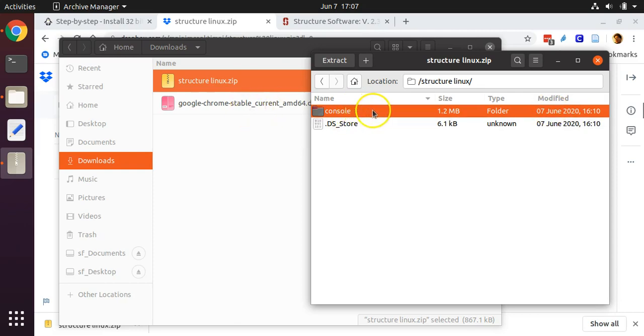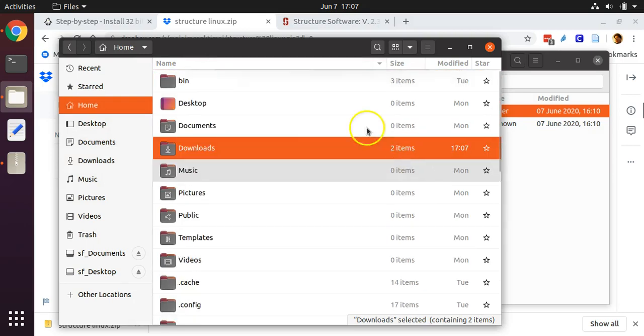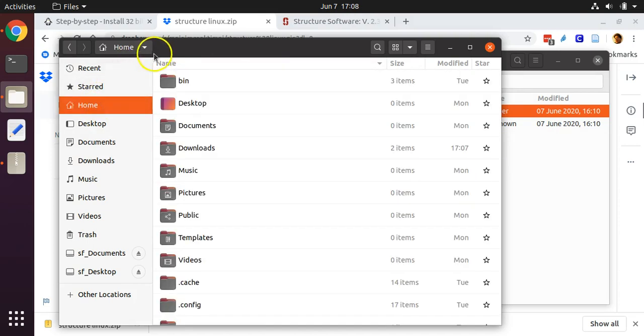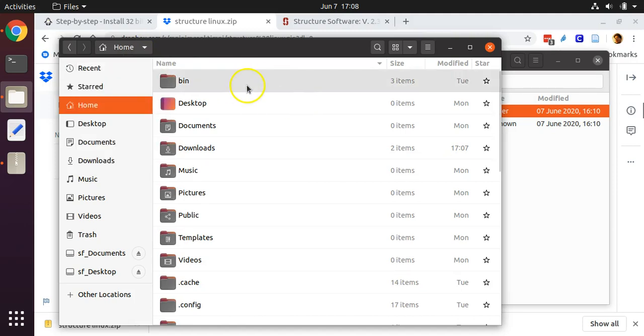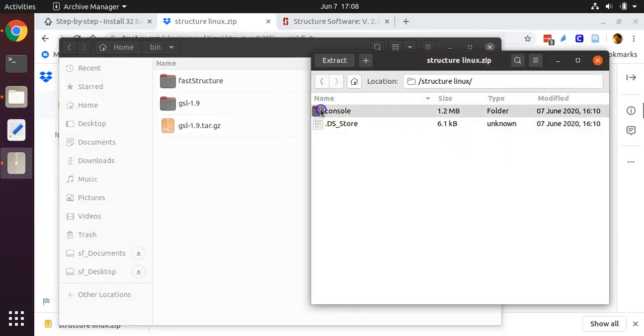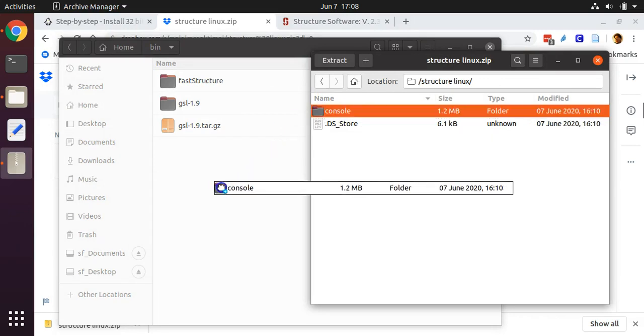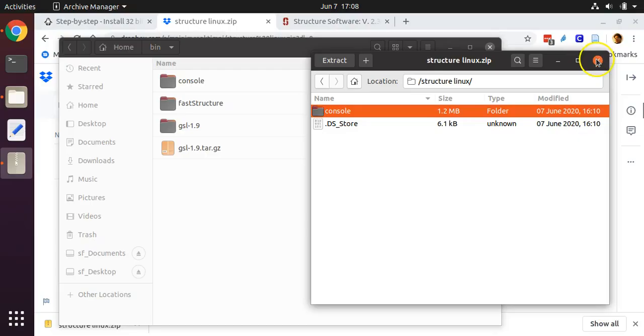To get it out of the compressed zip archive, go back to your finder window, go to your home folder, and look for your bin directory. If you do not have a bin directory, you can create one by highlighting the home folder and selecting new folder from the drop down menu. Double click on the bin folder. Drag the folder called console into your bin folder to decompress it and place it within that bin folder. Now you can close the archive manager software.